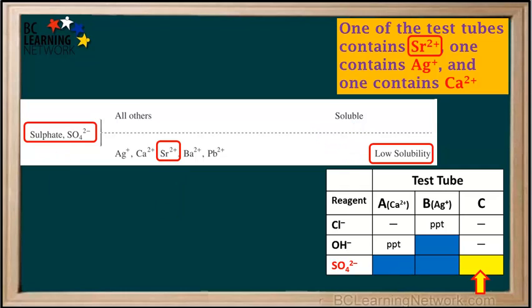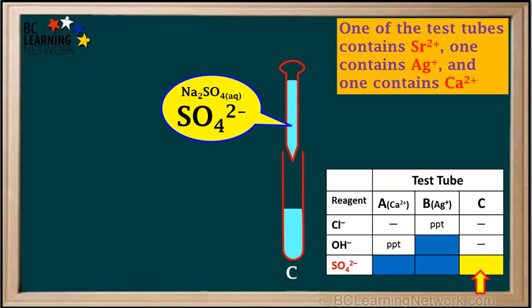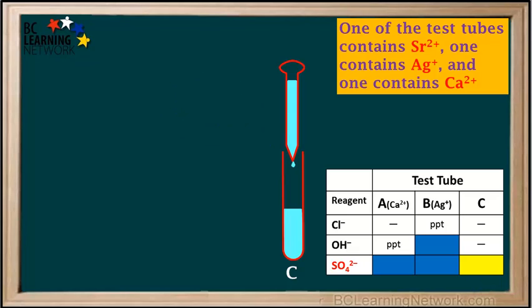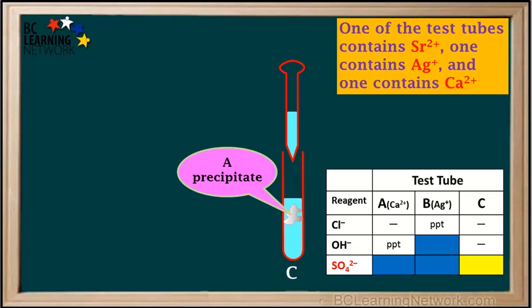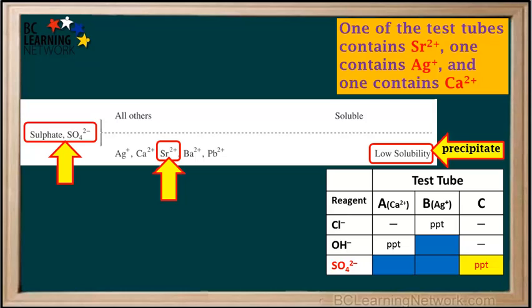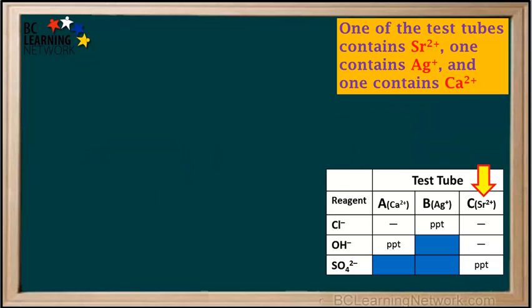Since we already know what's in test tubes A and B, we'll just add sulfate to test tube C. We fill a pipette with sodium sulfate solution, which is a source of the sulfate ion, SO4 2-. We add sulfate to test tube C and observe a precipitate. So we mark PPT in the cell for sulfate added to test tube C. Because strontium ions form a low solubility compound with sulfate, the presence of a precipitate confirms that test tube C contains strontium ions.